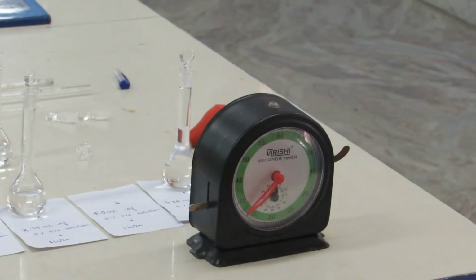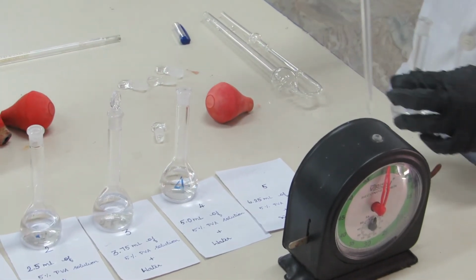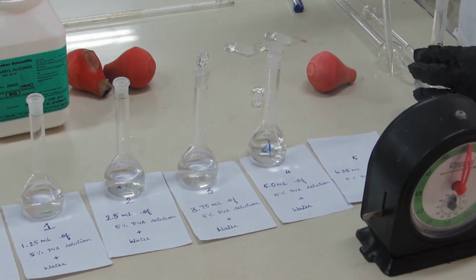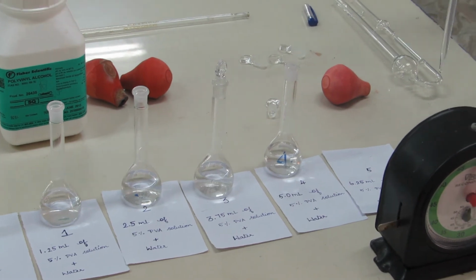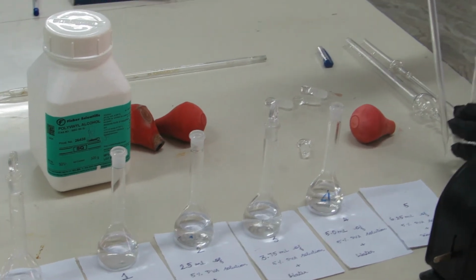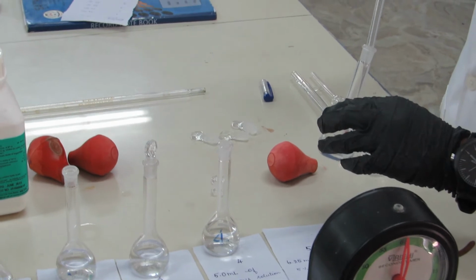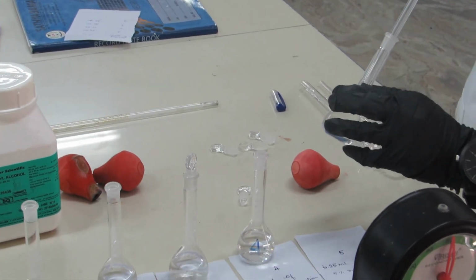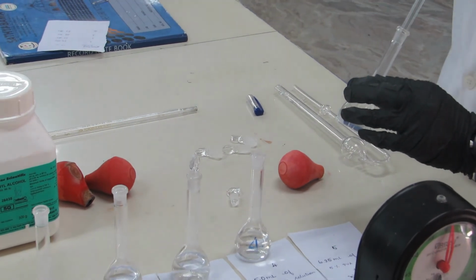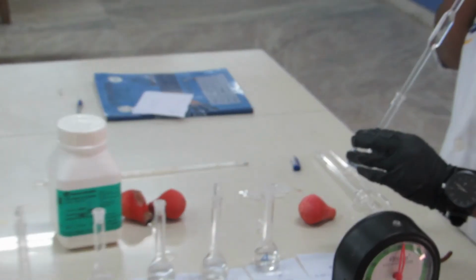Now the last concentration, that is 1.25% polyvinyl alcohol. With the help of a pipette, we are taking 10 ml of 1.25% polyvinyl alcohol.